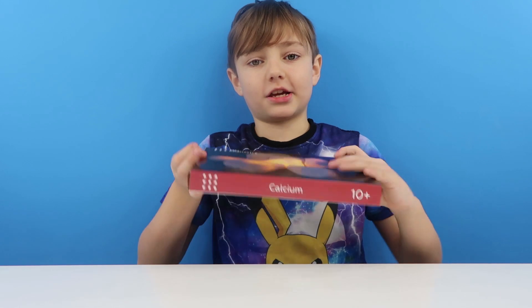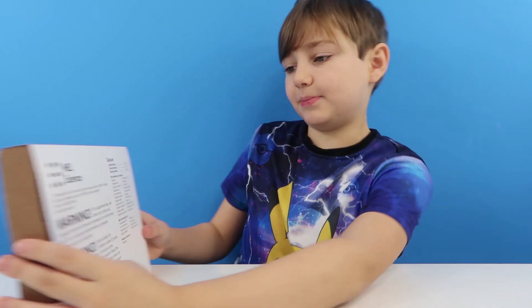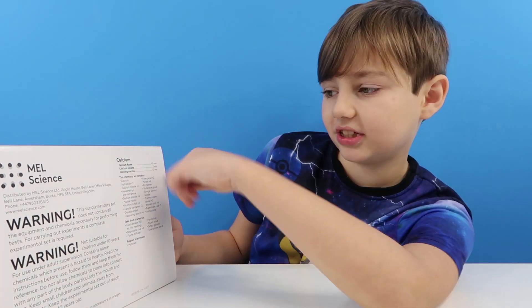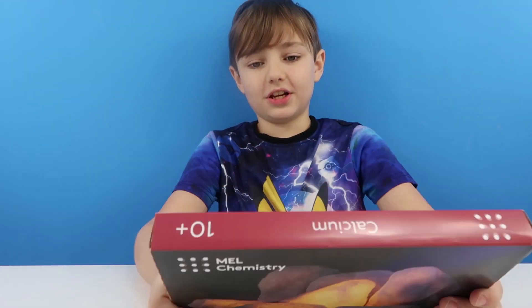So today we're going to be doing the pack — Calcium. And we are going to be doing two of these experiments in this pack: Calcium Silicate and Glowing Marble.